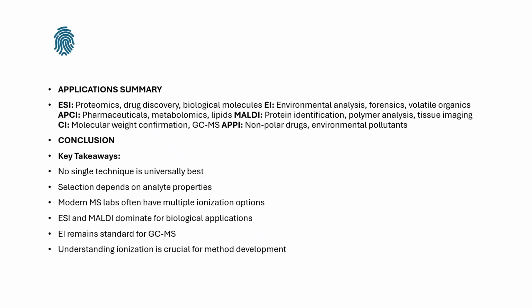So let me quickly summarize where each technique shines in real world applications. ESI dominates in proteomics, drug discovery, and anything involving biological molecules. Electron ionization is the workhorse of environmental analysis, forensics, and analysis of volatile organic compounds. APCI is heavily used in pharmaceutical analysis, metabolomics, and lipid analysis. MALDI is the go-to for protein identification, polymer characterization, and tissue imaging.